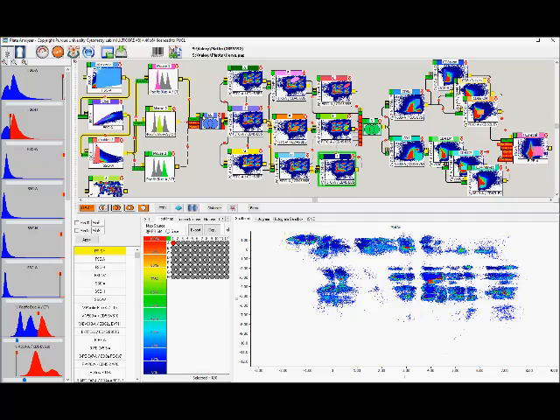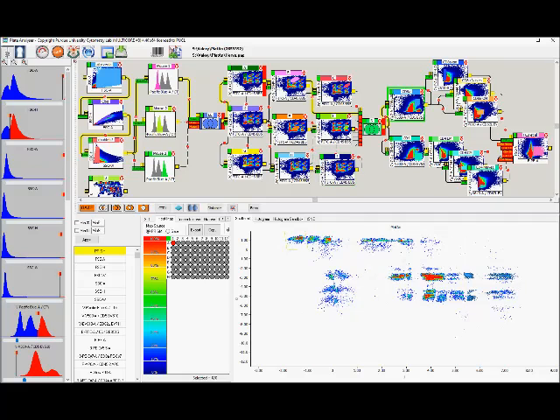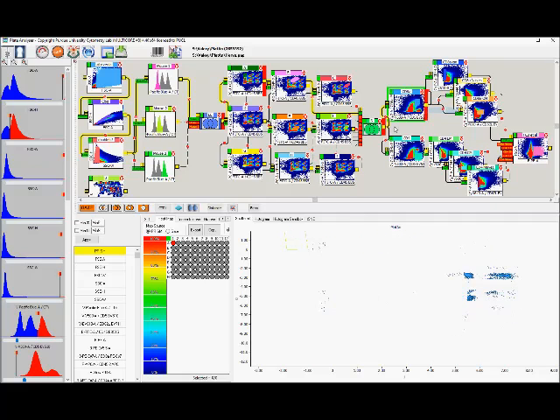And I can go through each of those, and I can now do exactly the same thing over here. So I've modal population mouse 1. I can actually modal population whatever this one is, and now I can modal this gate here, A, whichever is A. And then I can go over to CD8 and I can select that as modal.